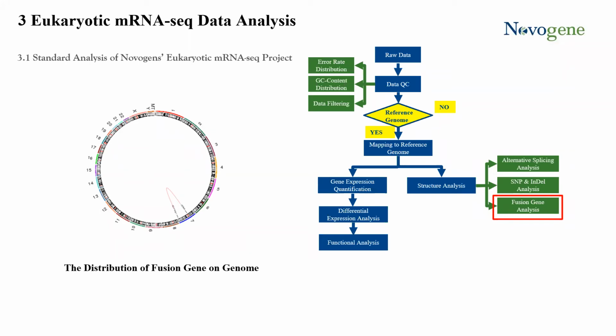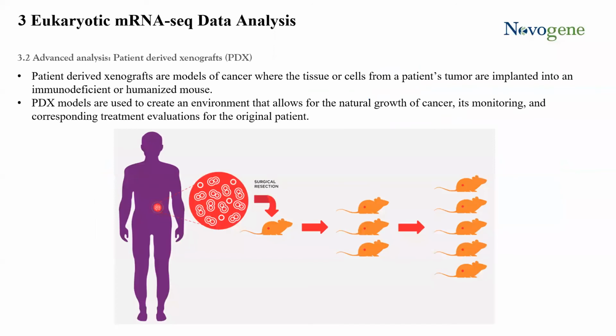So now I'd like to further the depth of this talk into one of our advanced analysis workflows, the patient-derived xenografts, or we like to call it PDX. First, I like to start by defining what PDXs are.